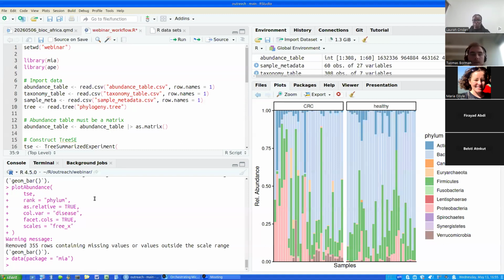What you need to know is the basics of R, the data.frame and matrix. The rest you just put into this TreeSummarizedExperiment object, and you can then work with this format instead. So you don't need to know data.table. Hope that answers your question.